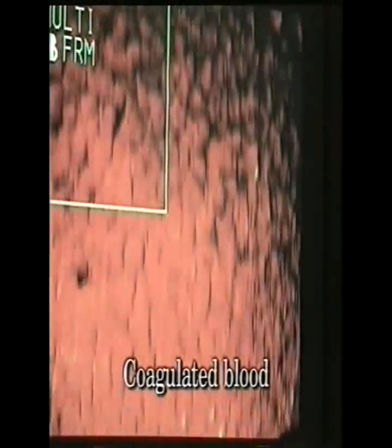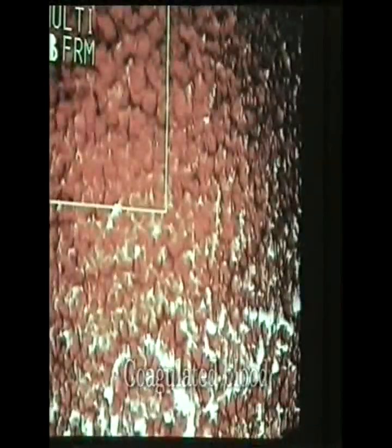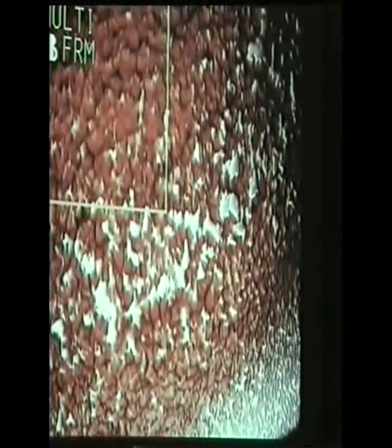In this coagulated blood drop, we see the free radicals as white spots. The more free radicals there are, the more the organism is inclined towards degenerative processes. In this picture, the surface contains quite a few oxidative materials.